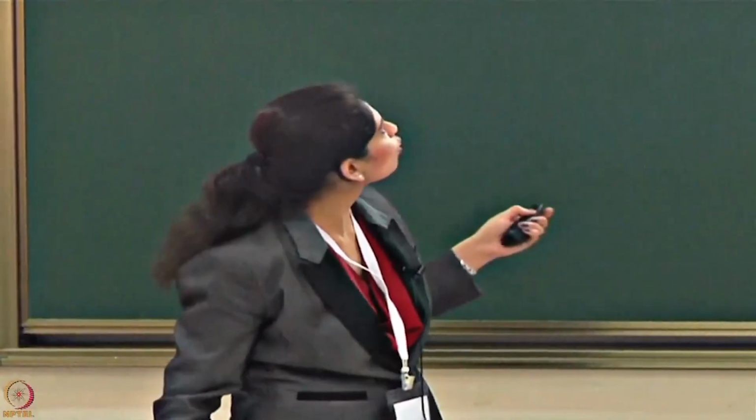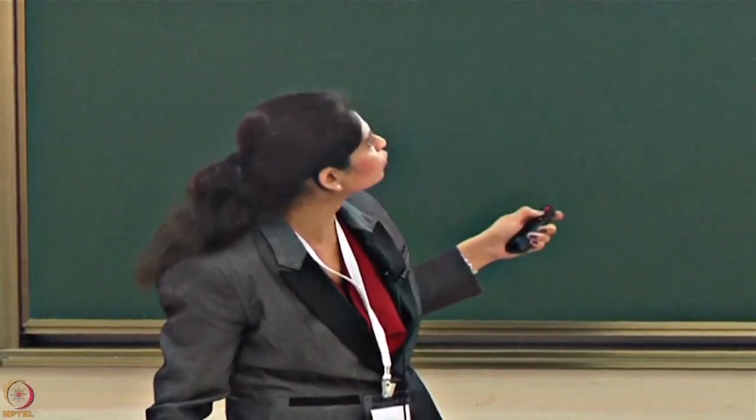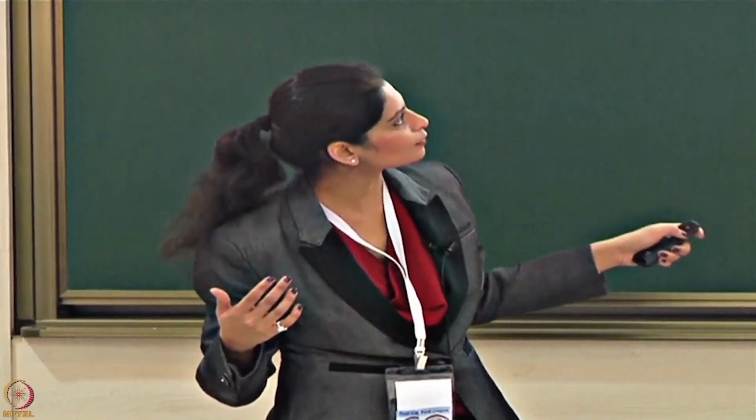It's not going to print. It's not going to get picked up. It's not going to get detected. So you've missed the whole set. You'll have to go back, fill it again and start. So it evaluates what's the issue, whether it's air, a thread, a fiber, or any other problem, or that you've forgotten it. It evaluates it and before it starts the printing, it'll show you, yes, I'm able to successfully detect it and I'm able to print it.